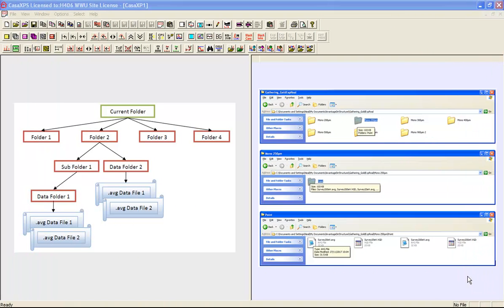In this video, the various options for converting Avantage data to VAMAS format will be explored. Data files that come from the Avantage data system are typically stored as a directory structure, and within the directory structure there are subfolders that contain the data files, and these can be converted to a .avg format, which is an ANSI ASCII format that can be converted by CasaXPS.